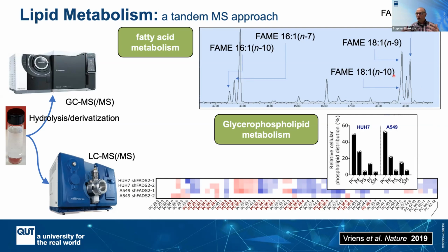And this speaks to the idea that, in terms of canonical metabolism, with the exception of sebocytes, some unusual mammalian cell types, this N10 double bond position shouldn't really be there. So essentially here we're relying on some very careful GC work to discover that in the context of these cell lines and in the context of the tissue, this different, non-canonical metabolism was taking place.